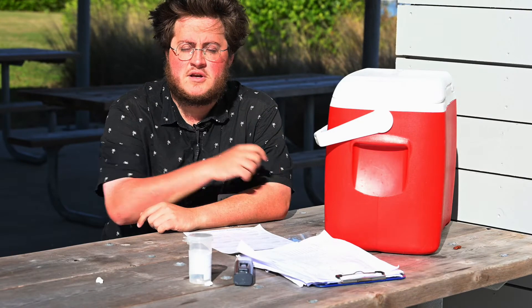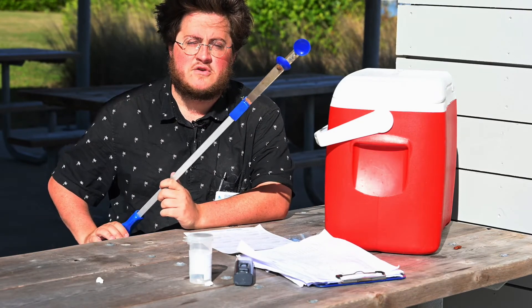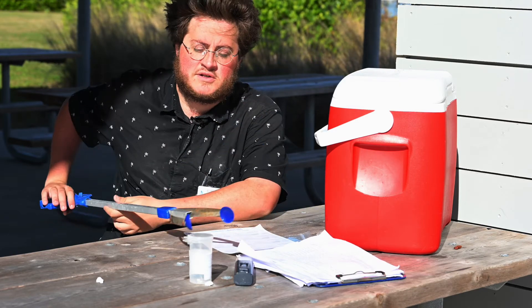For those hard-to-reach spots, you'll want a grabber that you can affix the bottle to and dip it six inches beneath the surface to successfully collect your sample.